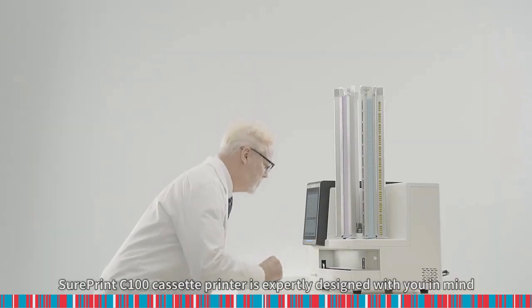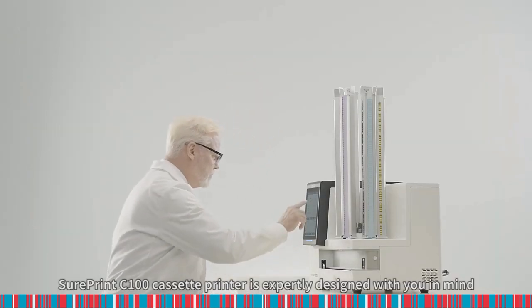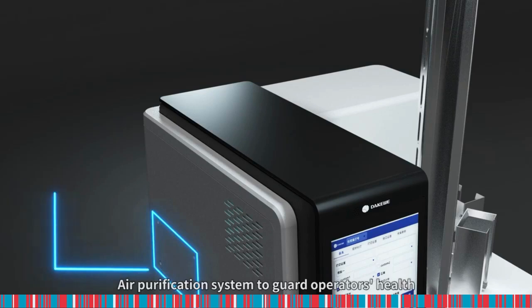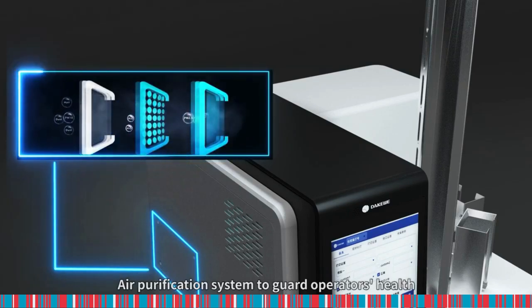Sureprint C100 Cassette Printer is expertly designed with you in mind. Air purification system to guard operator's health.